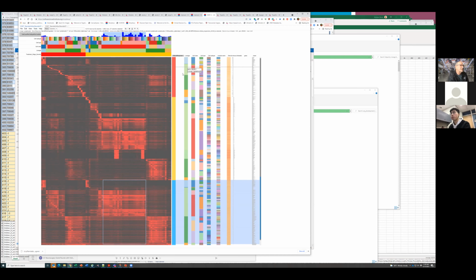Here are lymphocytes and myeloid cells, and these are the genes that are strongly turned off by steroid treatment. From there to there, there are all these genes that are incredibly well suppressed. If you just grab those genes and do a simple enrichment for them, this is what they show.